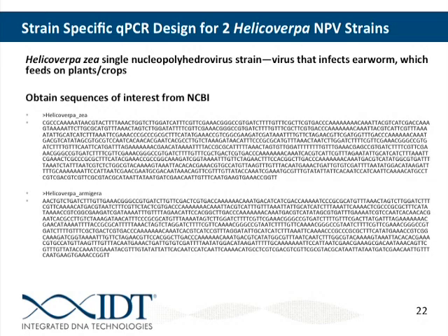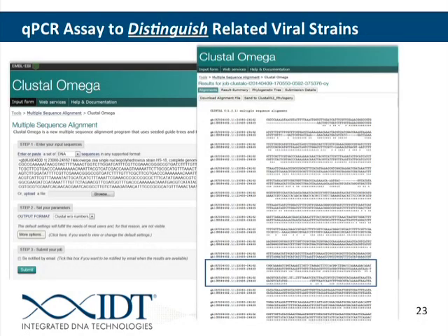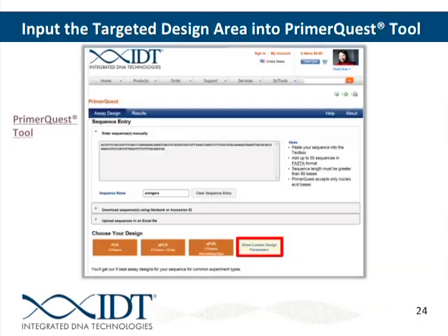And so this is that portion of the sequence that I had highlighted in the blue box from armigera. And this time we're going to, again, show our custom design parameters so that we can target that. We can increase the number of results to return, and we can also target the probe region as we did before to try to force PrimerQuest to put a probe over that region that's different between our two sequences.